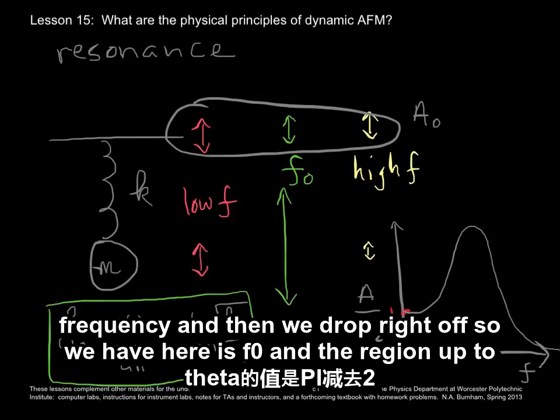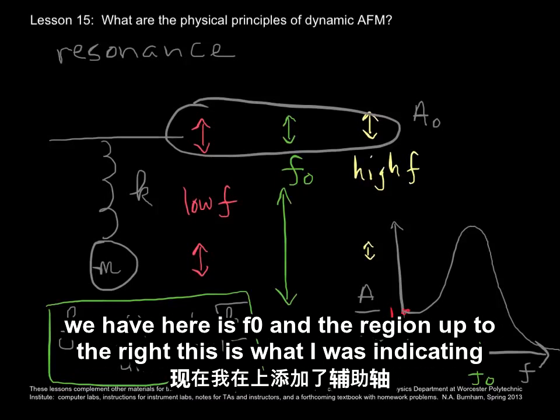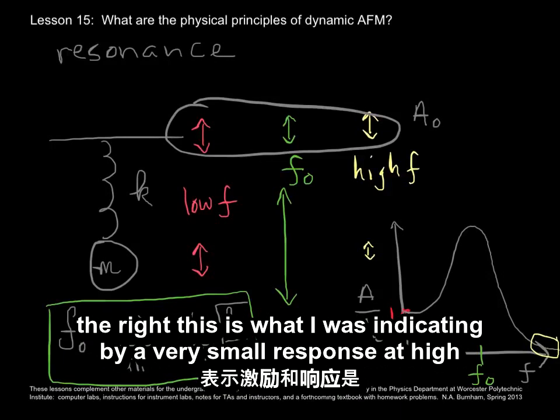So we have here is f0, and the region up to the right, this is what I was indicating by a very small response at high frequencies.